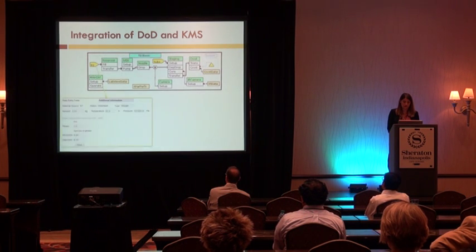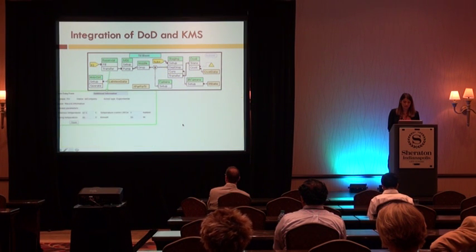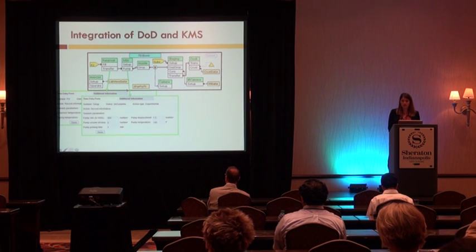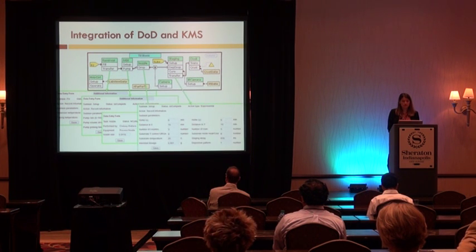So let's see how we specify each task and subtask. First we start with the material source. You specify the formulation parameters, and you specify the substrate parameters. Then you can specify the reservoir subtask parameters. And then printing settings, you can specify the nozzle parameters, different staging. So you can change or manipulate the parameter values, the printing settings associated with the system.